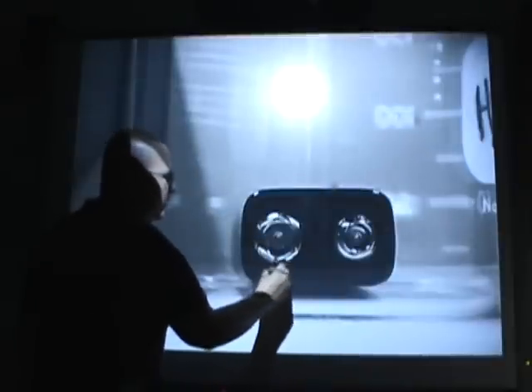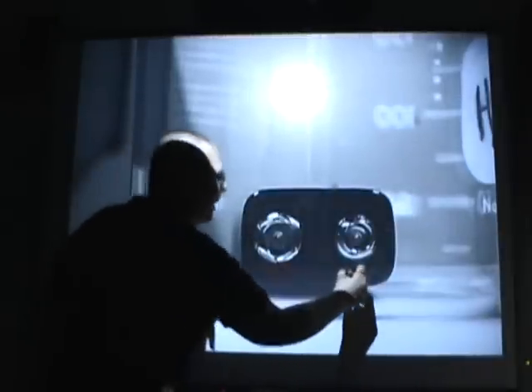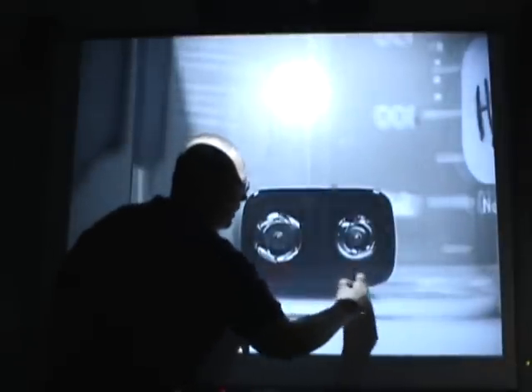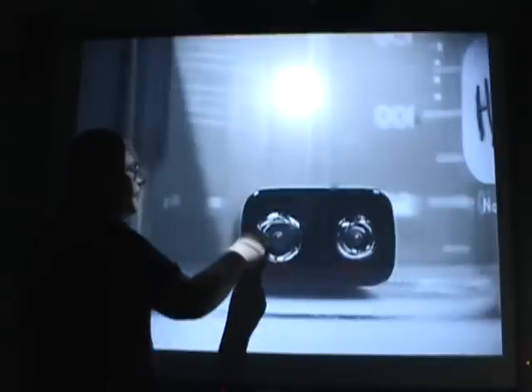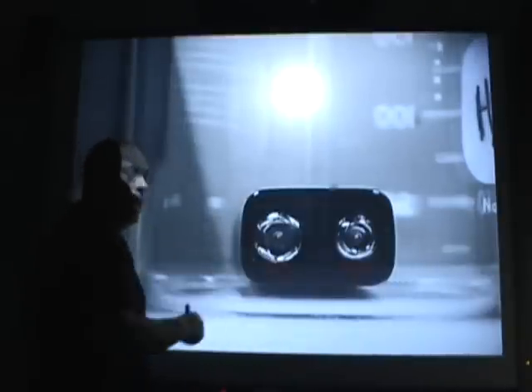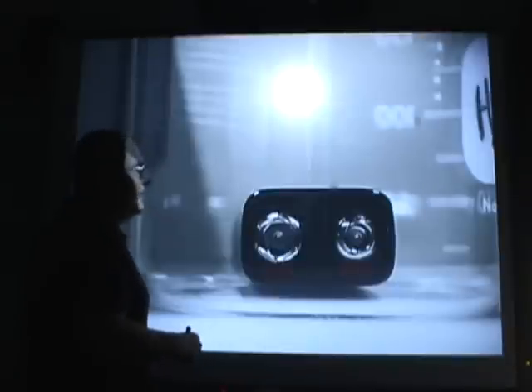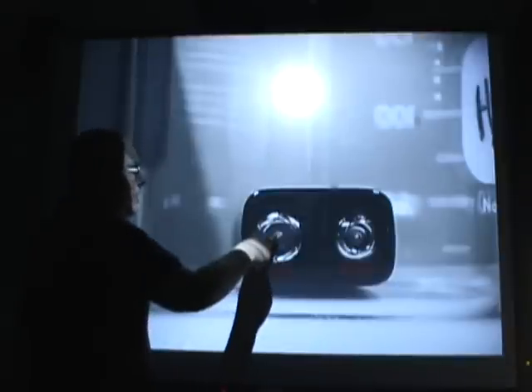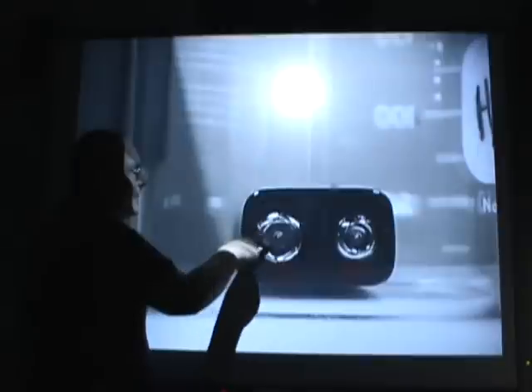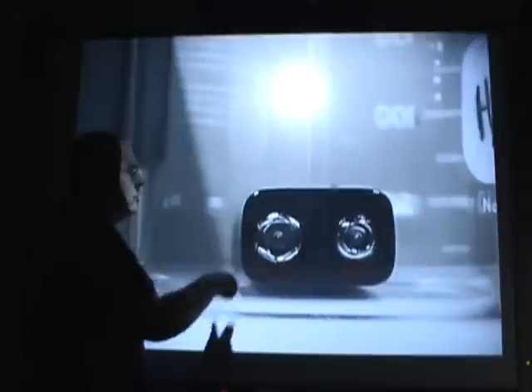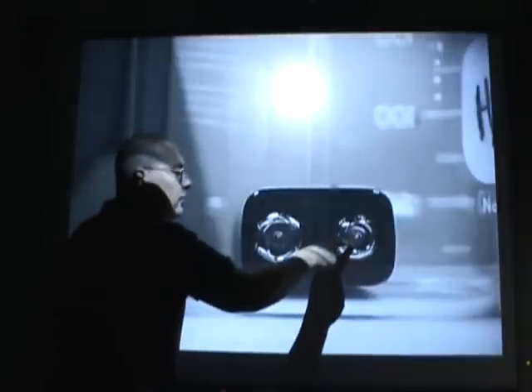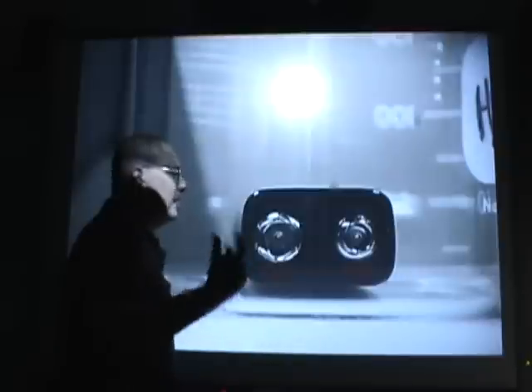This is the negative terminal of our 9-volt battery. This is the positive terminal of our 9-volt battery. Electrons are coming out of the negative end, and electrons will go in to the positive end. So that means that this end of the battery can give electrons to a species that needs to undergo reduction, and this can pull electrons away from any species that will undergo oxidation.